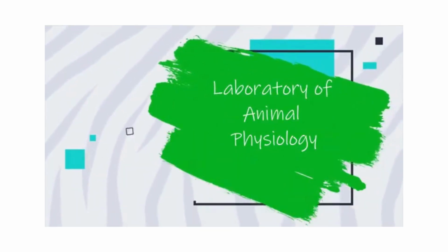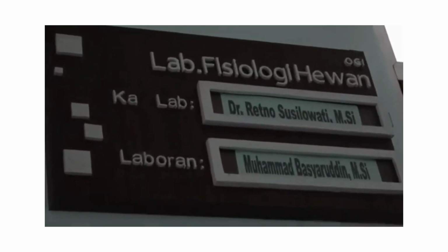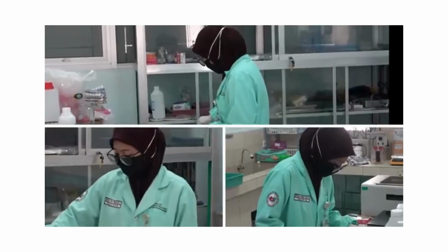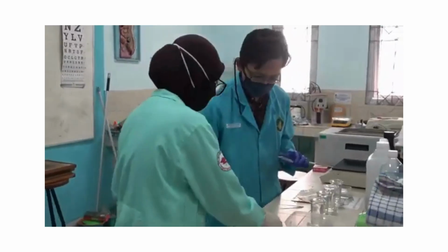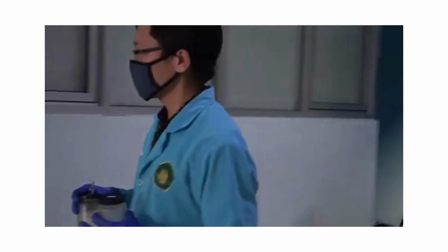Laboratory of Animal Physiology. Laboratory of Animal Physiology is one of the research laboratories at the biology study program. Experiments using experimental animals are carried out in this laboratory to determine the metabolism and tissue structure of animals. Various natural ingredients are applied in order to see the reaction in the animal's body. This laboratory is supported by several tools such as microscope, blood analyzer, incubator, centrifuge, and other general tools.